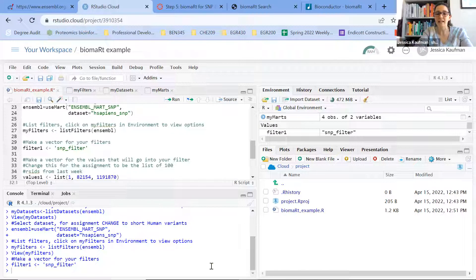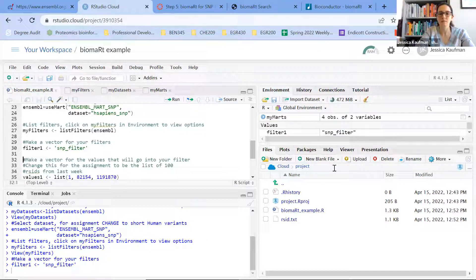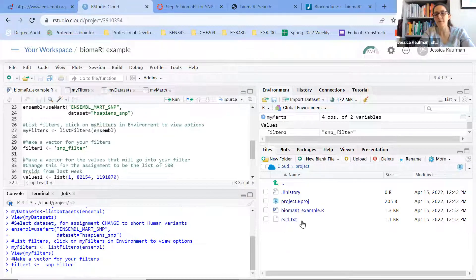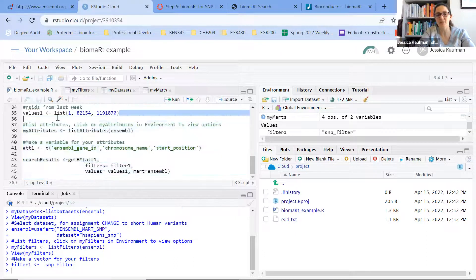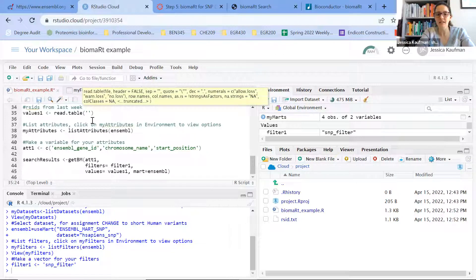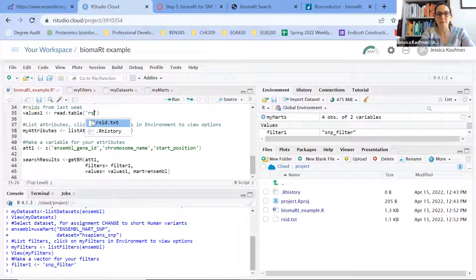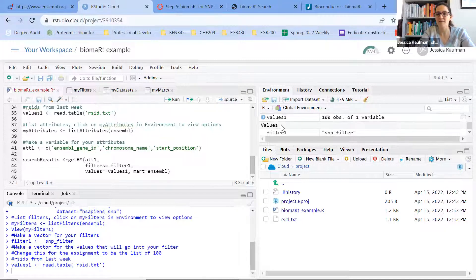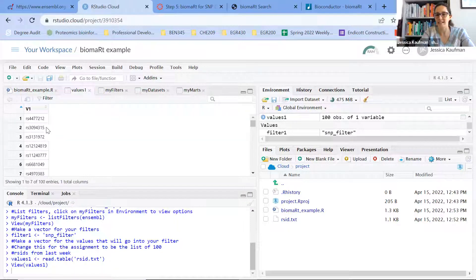Now I need to get the values that will go into the filter, so I'm going to do this by reading in the file. I'll pause the video for a second and upload the file to this workspace. I got the file on my computer — I called it rsid.txt; yours might be called mycall.txt. I can get the names of all the SNPs into the values variable by using read.table with the name of the file. Now that variable has 100 RS IDs.